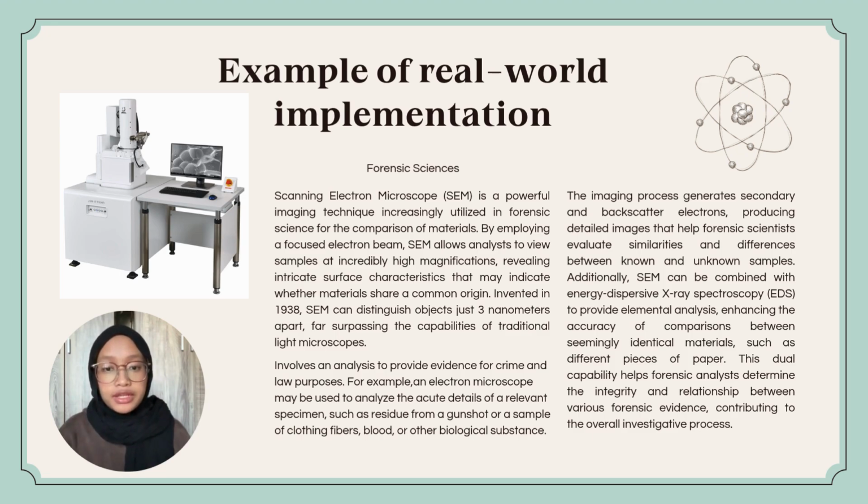For example, an electron microscope may be used to analyze the acute details of a relevant specimen, such as residue from a gunshot or a sample of clothing fibers, blood, or other biological substance.